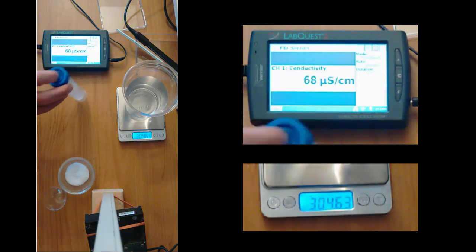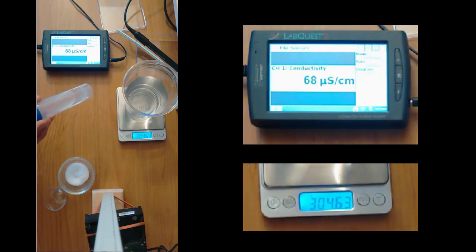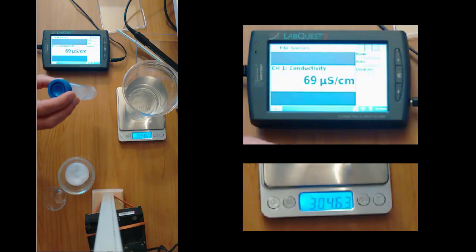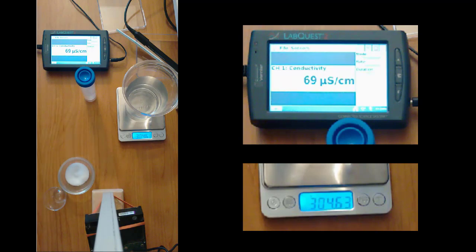As with the filtered tap water, I'm using the same standard as we created in trial number 1. So the actual salt concentration of the standard is something that we've already calculated.